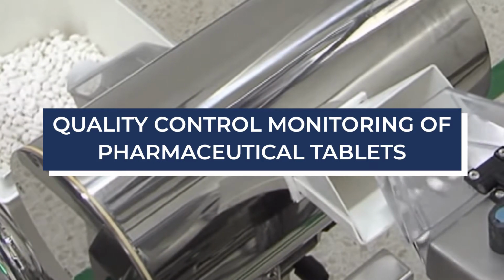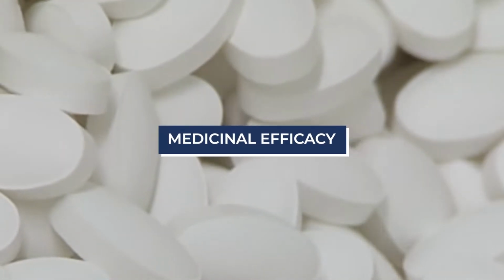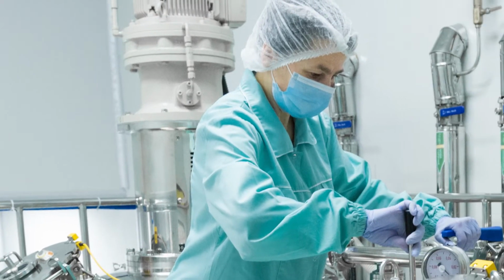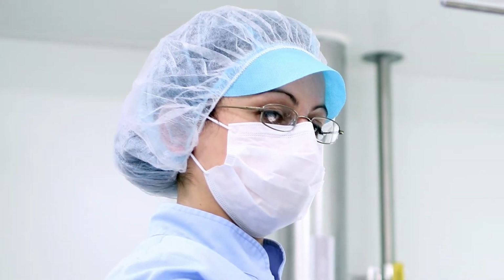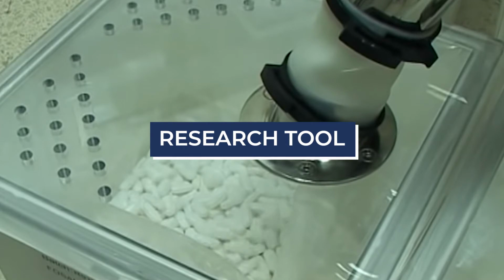Monitoring the chemical makeup and uniformity of a tablet during manufacture is necessary to ensure the medicinal efficacy of a drug. Uniformity must be maintained by checking that: 1. The proper amounts of both active and excipient ingredients remain constant. 2. The particle size of each constituent drug remains consistent, ensuring proper release timing and dynamics during digestion. 3. The ingredients have maintained their proper form and have not changed during manufacture due to high temperature, production issues, or other environmental conditions. Chemical imaging is an effective at-line or research tool to develop and improve your process analytical technologies.